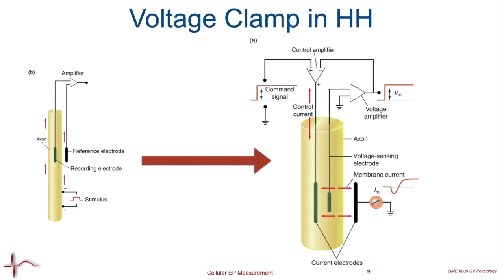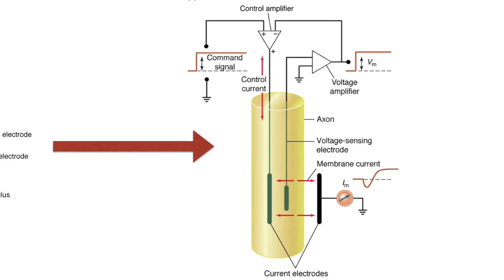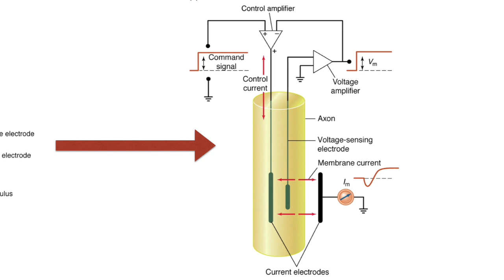And this is the measurement setup that enables us to do this. Again, it goes back to Hodgkin and Huxley. They carried out these experiments, developed this type of instrumentation. There's a second electrode. There's an electrode that applies the voltage, the transmembrane voltage, and then there's an electrode that measures the resulting current. Again, we won't go into details, but we can see here that there are ways to recreate the conditions I described in that equation and use it to make very useful measurements that ultimately helped us explain or describe the way conductance changes in the face of changes in time, changes in membrane voltage, and really explore the true nature of these ion channels. So voltage clamp, very important technique.